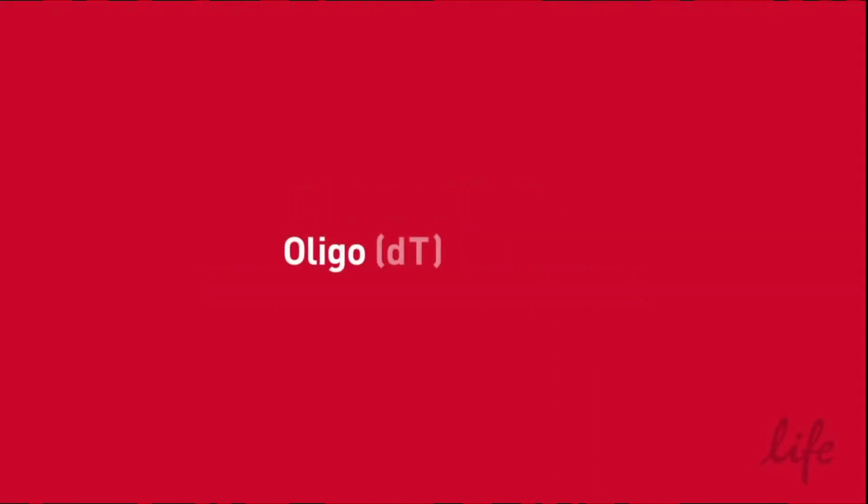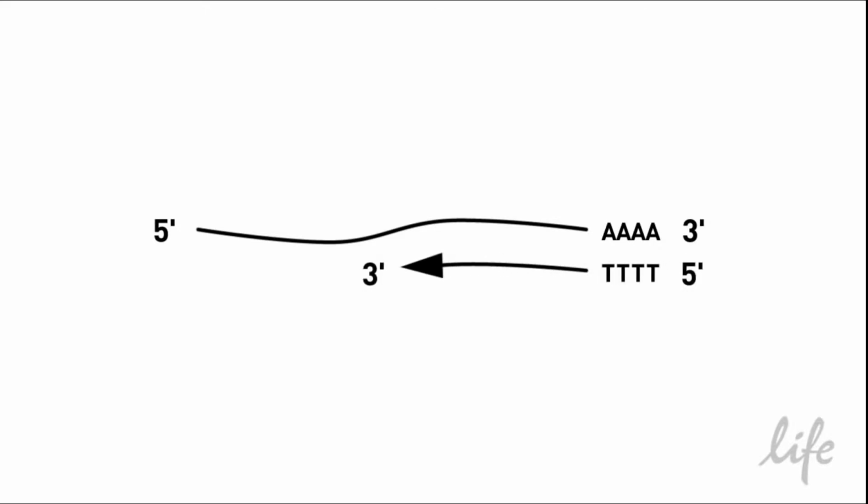The common choice of primer is oligo-dT. It binds to the 3' poly A tail of eukaryotic mRNA transcripts. The limitation with this choice is that you can get a 3' bias of your sample due to where the primer binds. In addition, oligo-dT is not compatible with non-eukaryotic or degraded samples due to the lack of a poly A tail, and hence the oligo-dT primer cannot bind.